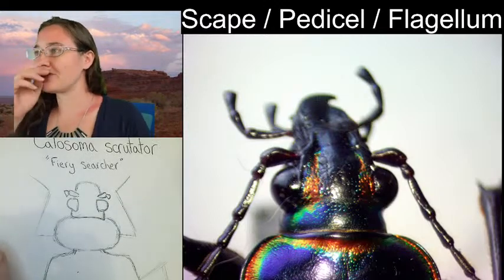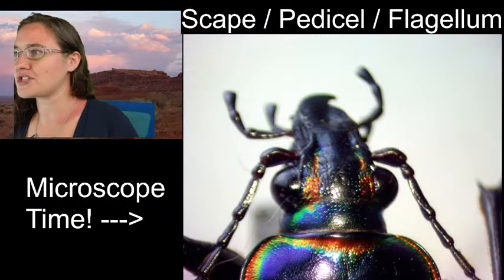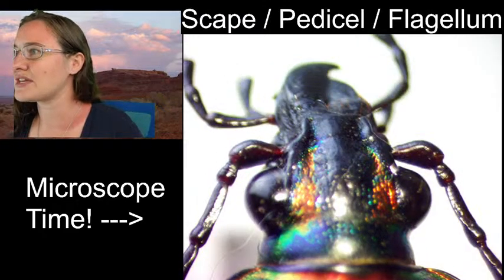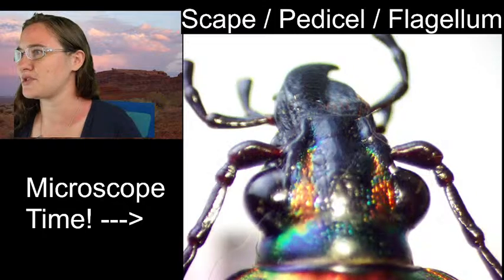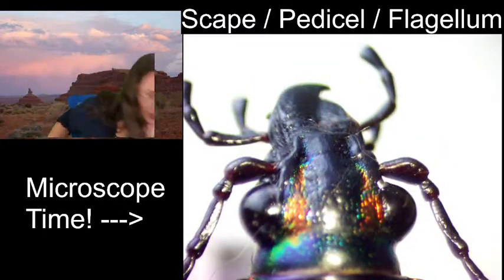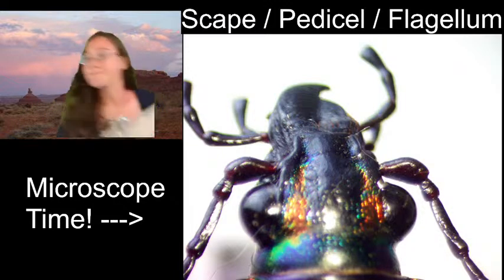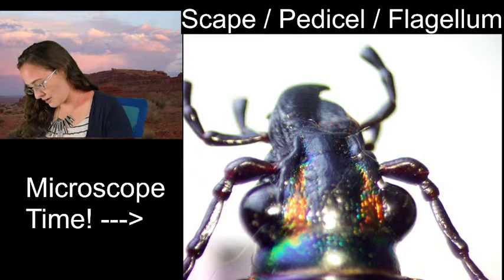Now, moving forward, I'm going to change the focus just a little bit, maybe zoom in a little more, because I want to be able to see some of these segments in the head. I did want to show you, where'd my book go? There it is. I did want to show you, I was going to look up one more word for you.